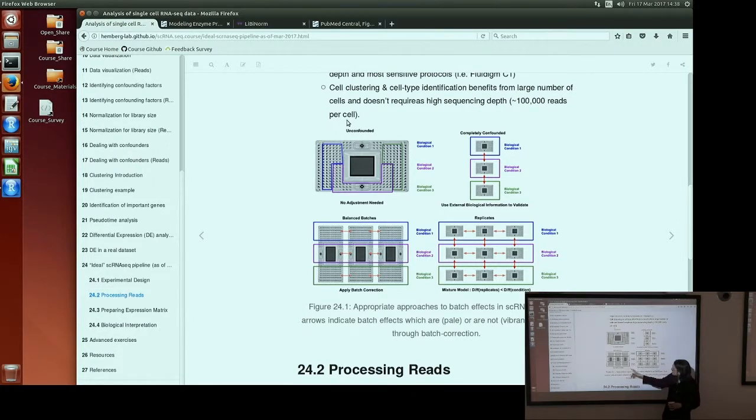If you do your conditions on the same plate, but across multiple different plates, you have batch effects, but you can correct for those statistically. And if you have replicates, you can correct for some batch effects and not others, so it's generally better to use mixture models and models that can account for batch information as well for looking at those data sets.